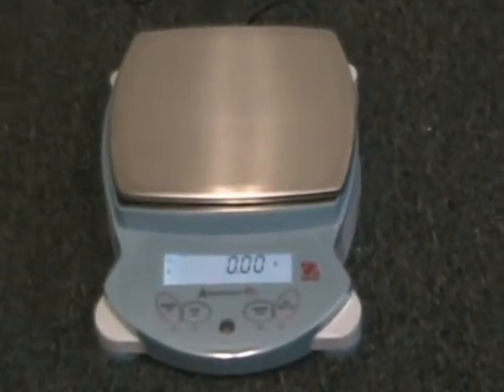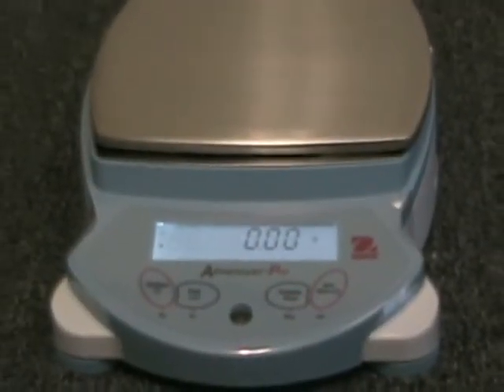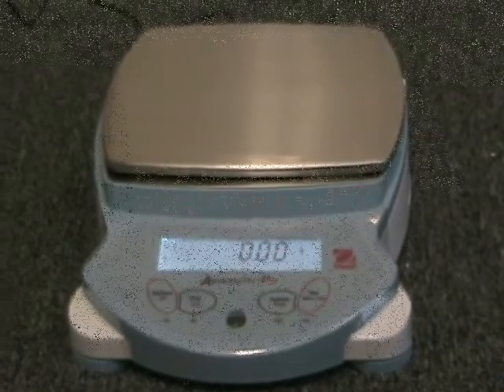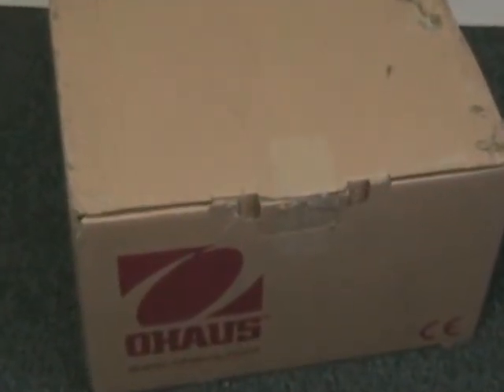The Adventurer Pro also includes enhanced parts counting, below balance weighing, animal dynamic weighing, check weighing, percentage weighing, totalization, and display hold application modes.